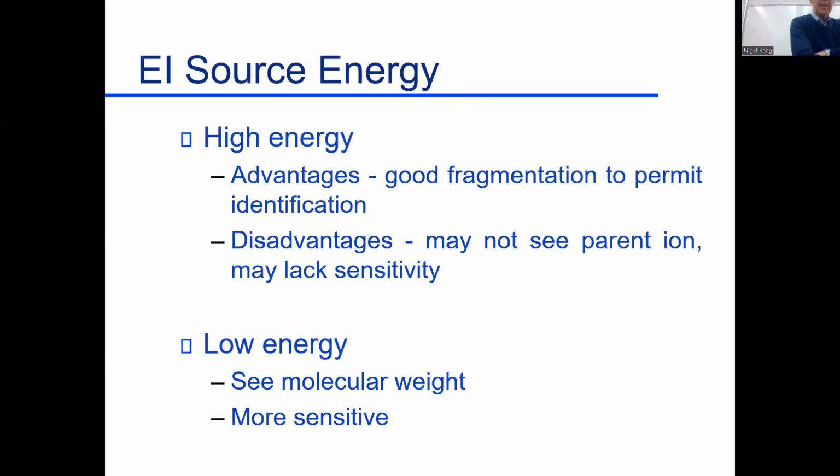With high energy, as I said, we get good fragmentation. We blow it into lots of pieces, a lot of fragments. It's easier then to look at a fragment and say, oh, that's that, and these are other small fragments, easy. Oh, I know what this is, and so on. So you can put them together. Good fragmentation actually makes identification easier.